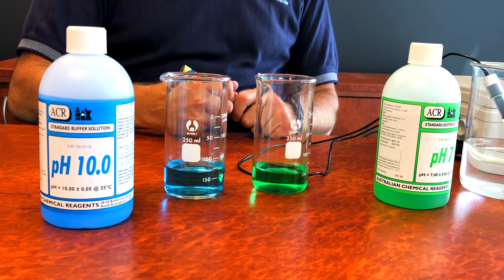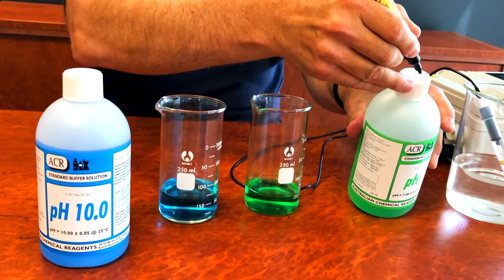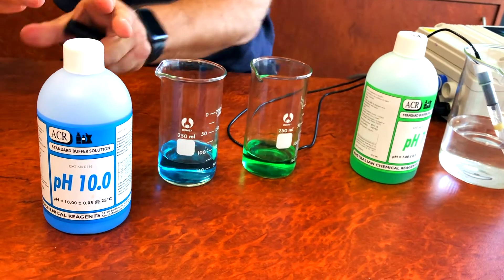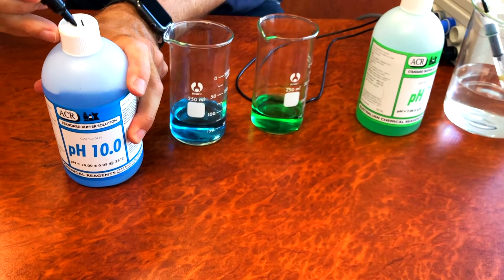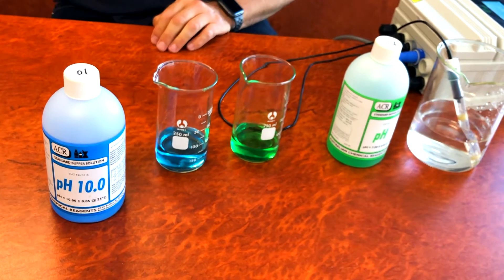A tip I can offer is that you can mark or write the number of the buffer on the cap. So I'm going to put 7 on that cap and 10 on this cap so that when you take the caps off you don't get them confused and you don't contaminate the buffer solutions.